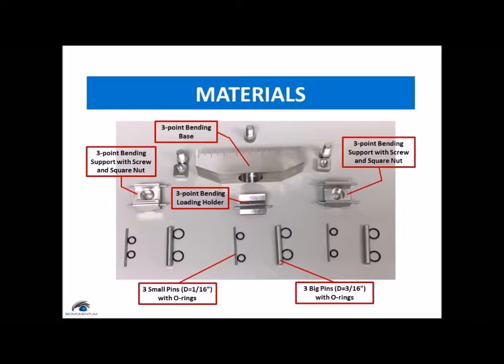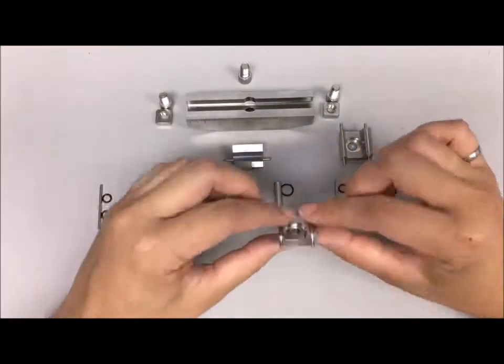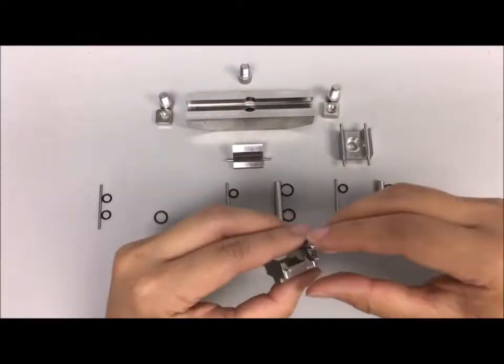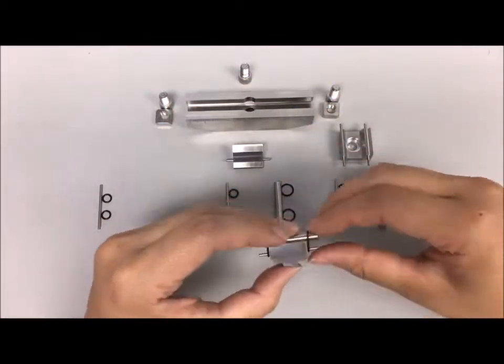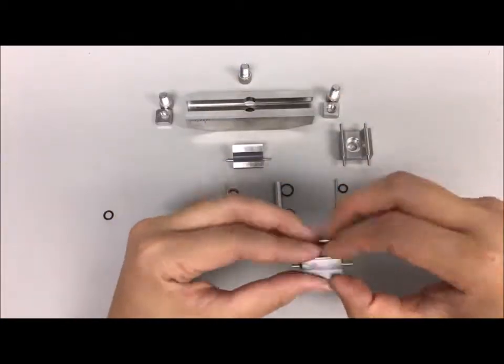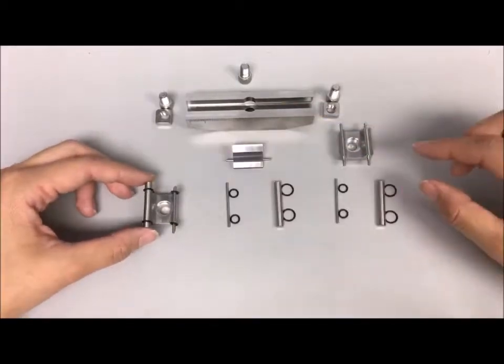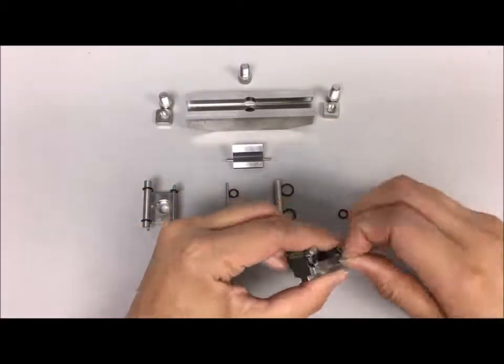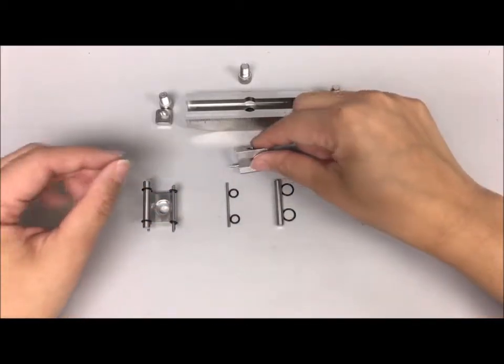Secure a big pin on the three-point bending support using the appropriate o-ring, then secure a small pin on the three-point bending support using the appropriate o-ring. Do the same for the second three-point bending support.